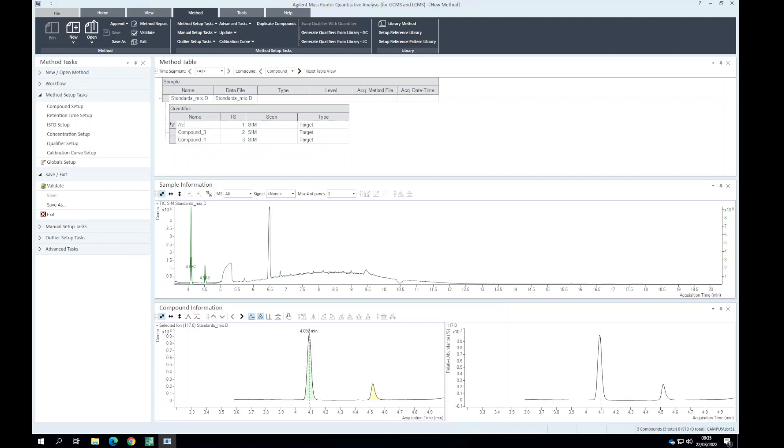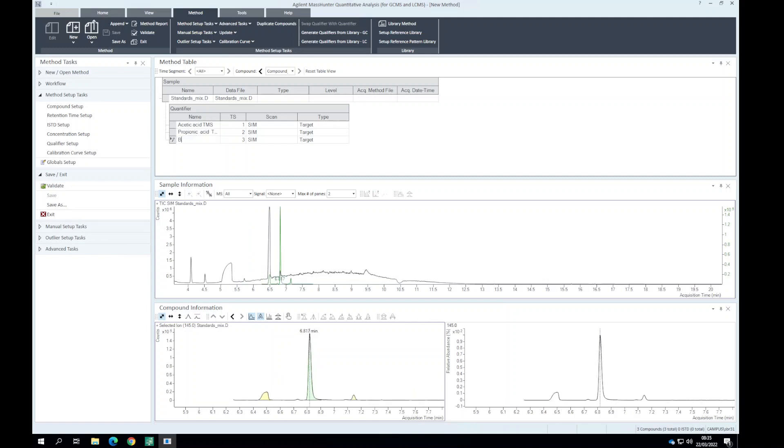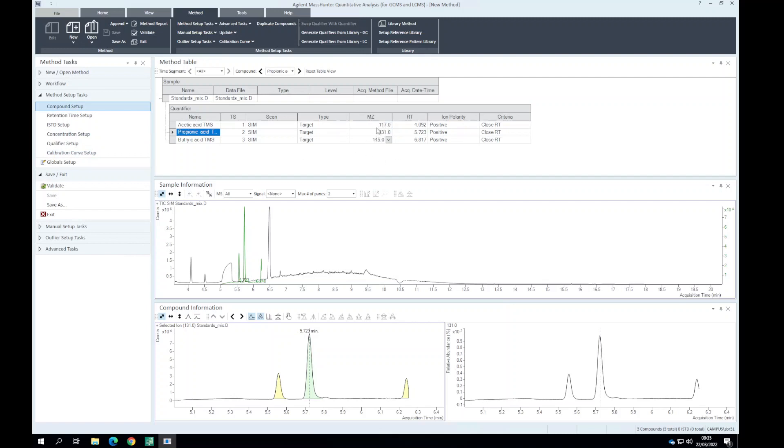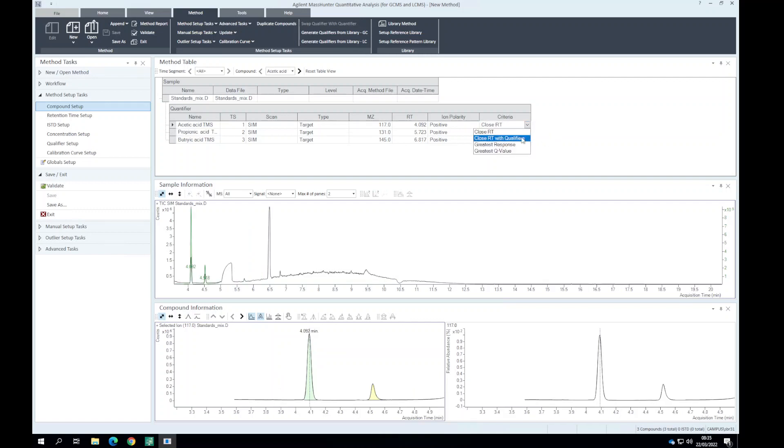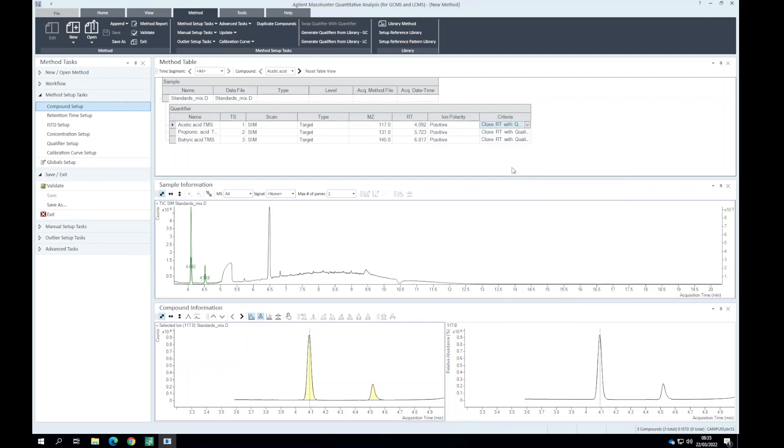Acetic acid TMS derivative. Now what we can do is systematically go through this menu. In the compound setup we've got the qualifier ion masses in there. We can also set the criteria by how it matches. We can have a close retention time with qualifier ions which sometimes improves the way the software is finding a peak.